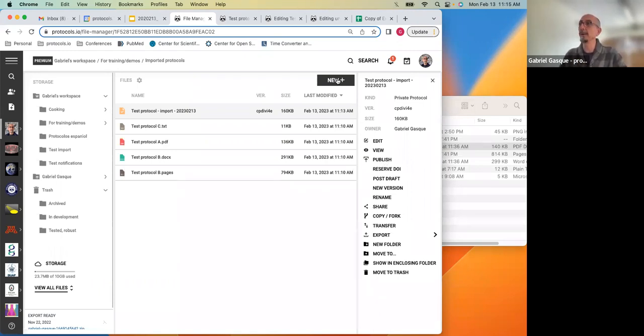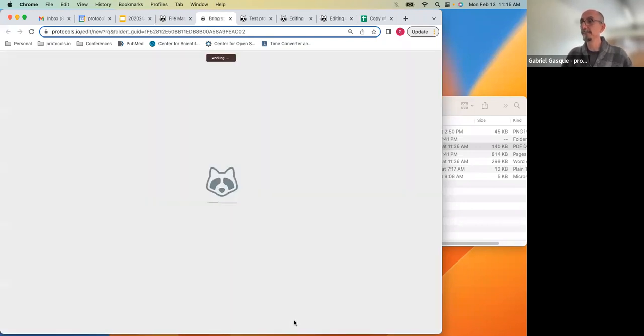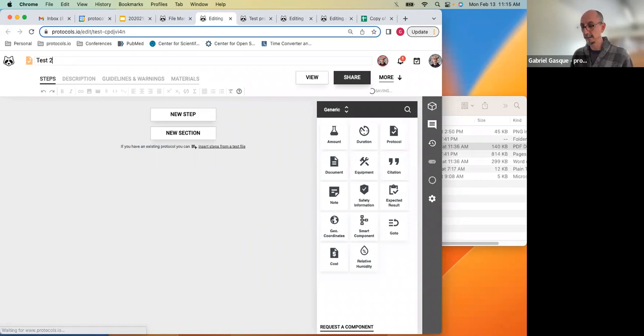To do that, I'm going to create a new protocol. I'm going to select the folder. I can give it a title.